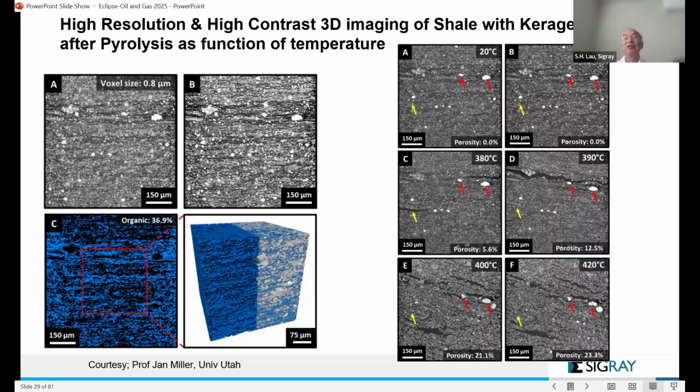After that, you'll be able to see where the organics are. Then you can do your micro CT to scan where the organics were, so that those are the pores left over after the organics are burned off, and then you can calculate your porosity that way.